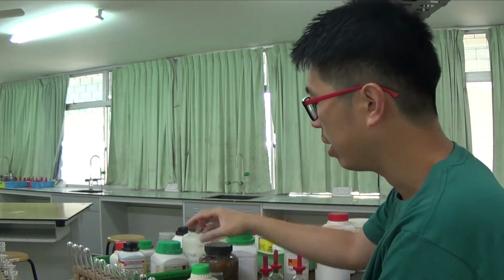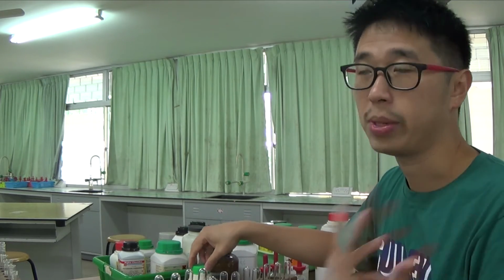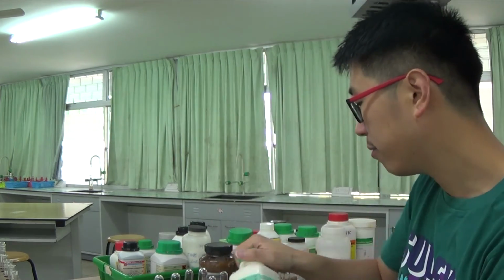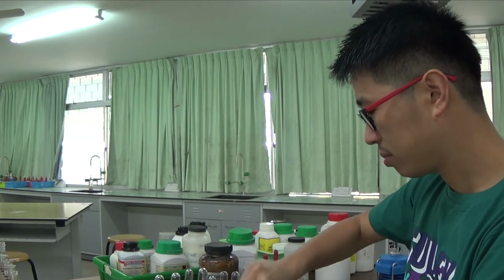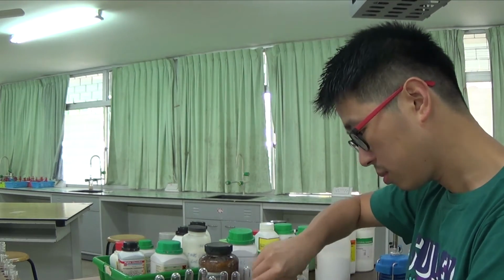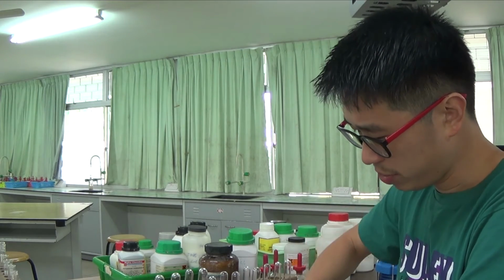I won't do the heating bit of the solid again because I've already shown you enough on water of crystallization. So I'll just scoop out ammonium iron(II) sulfate first. Clean spatula. I think this one hasn't been used for a long time.